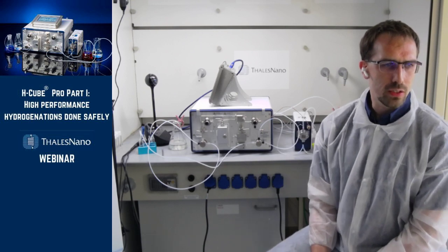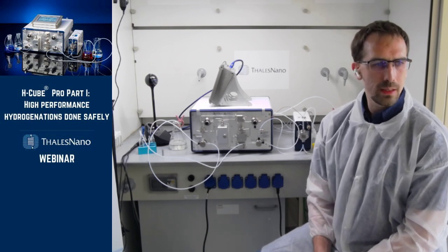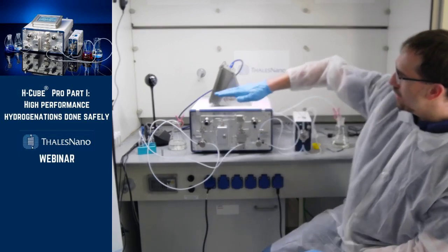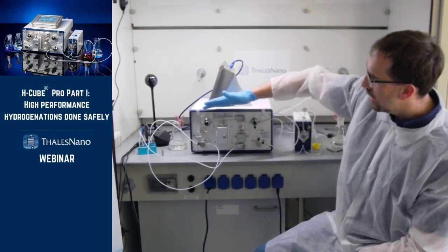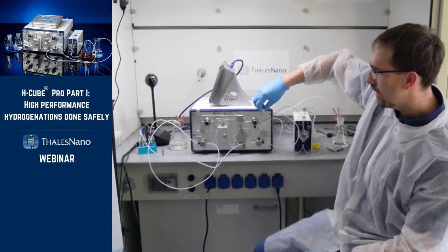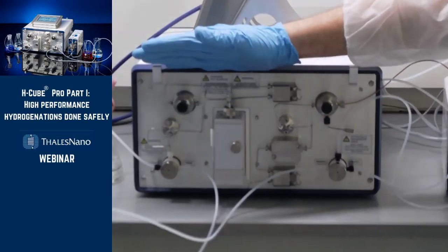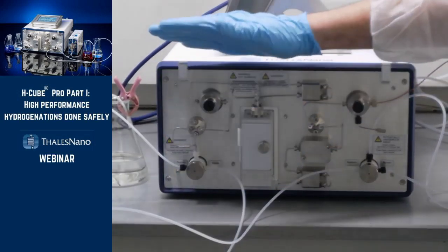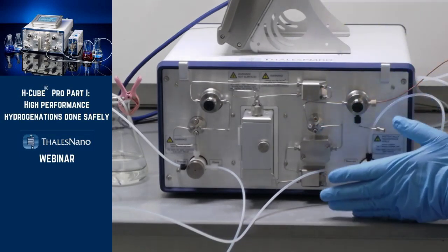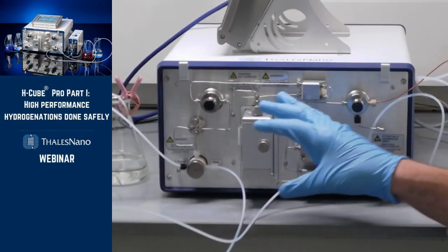What are the safety features during reaction in the system? Can you please elaborate a bit more on that question? I mean, in a normal setup, you can see these metal pieces up here and here. So normally we have a plastic cover here. If anything should happen, like a tube comes off or something like that, then the customer is protected from the reaction zone.